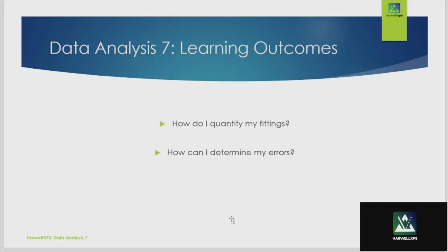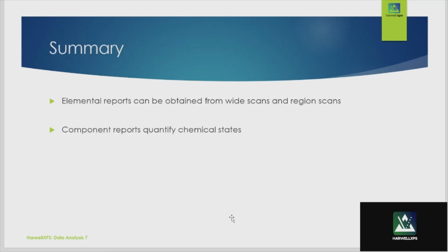So that is a summary of how we can quantify our XPS data and how we can report some stuff. There's plenty of files for you to work with and play with, and we will have some worked through examples in the question and answer area below. So do have a go at those, and follow along the videos if you'd like to check that what you're doing is good.